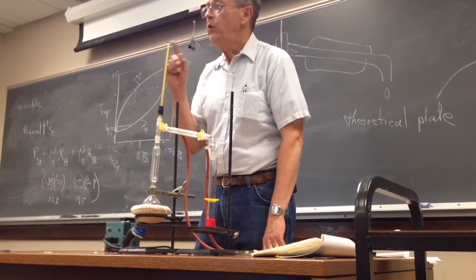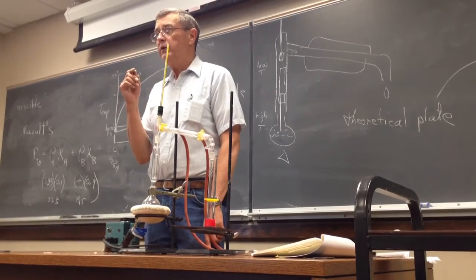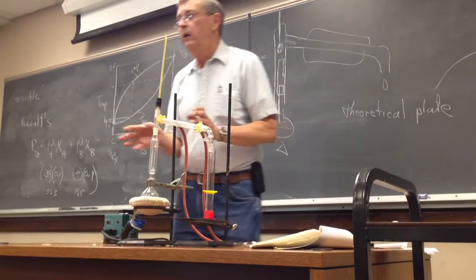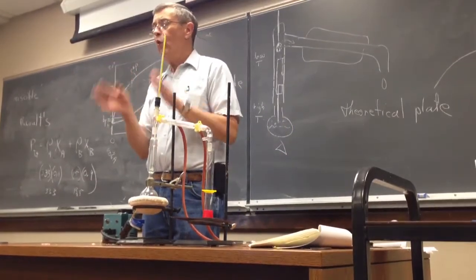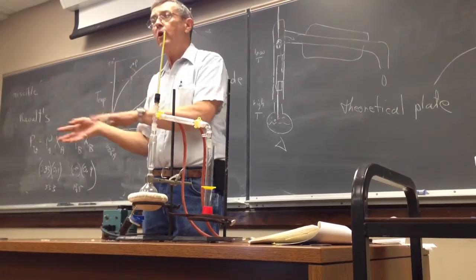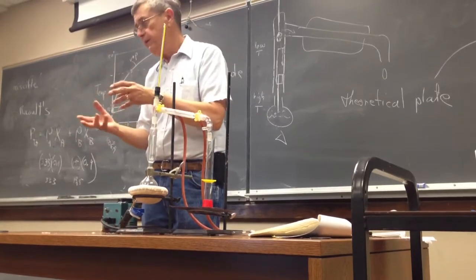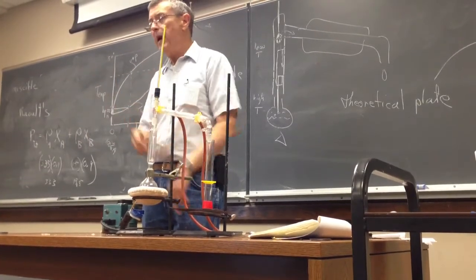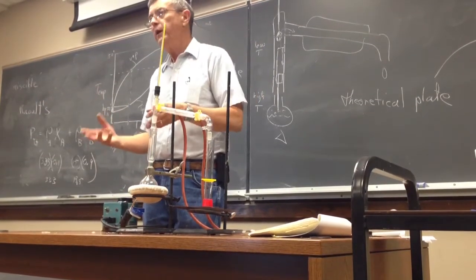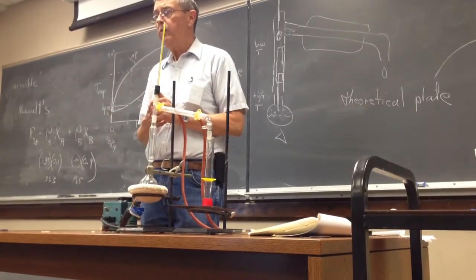Okay? Make sure that you are on time for lab next week, because although you can come early and start to set up, that would be fine. But at 1 o'clock, what we will do is take you over first and show you how to use the GC. Because it's more sophisticated than just there's the box and here's the needle and stick it in. Okay? You're going to learn how to run the GC. And then you'll come over and finish setting up your apparatus and doing the distillation.